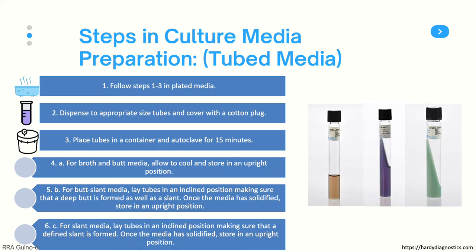Now let's look at the steps for preparing culture media in tubes. Follow the same first three steps from the previous procedure. Then dispense to the appropriate size tubes and cover with a cotton plug, or if using screw cap tubes, cover them with the caps. Once autoclaved, you can proceed in several ways. For broth and butt media, simply allow the tubes to cool in an upright position and store them upright as well. For butt slant preparations, lay the tubes in an inclined position, making sure that a deep butt is formed as well as a slant. Once the media has solidified, store the tubes in an upright position.